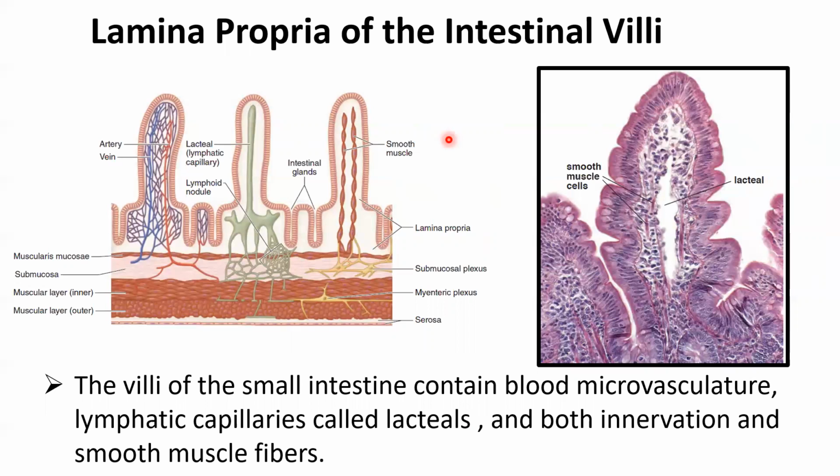This is a high magnification of a villus. Again, you can see these are the glands here, crypts. These are the enterocytes, the cells covering the surface. And you can see in the middle of the core, the lamina propria, this space here is a lymphatic vessel. It's usually the biggest one, and a lot of the time you can see that easily on the histological section. When you look at the section, you should be able to find some of the villi, and this central canal is going to be the lymphatics. We call it the lacteal duct or lacteal.